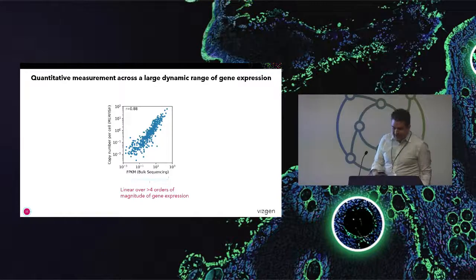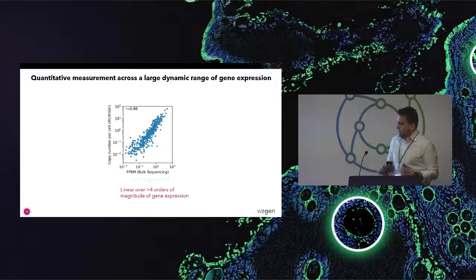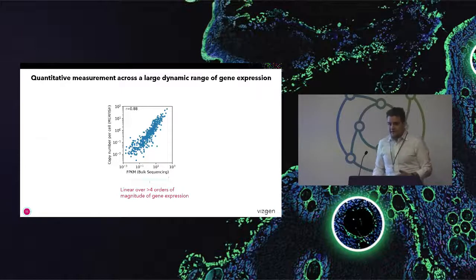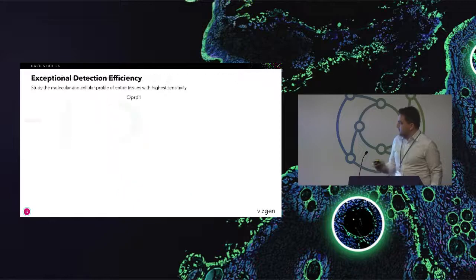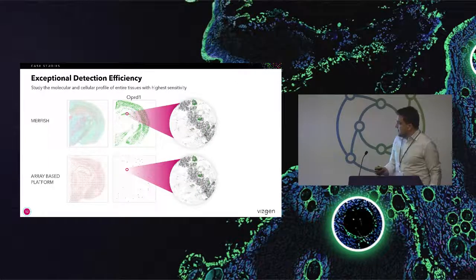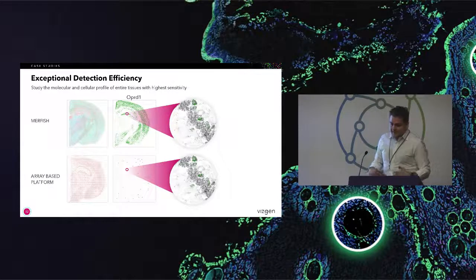But additionally, since transcriptomics is a relatively sparse signal in the first place, a lot of very functionally relevant genes are expressed at just a few tens of copies per cell. The ability to detect a large fraction of those tens of copies is really critical to understanding what's happening in that biological tissue. This comes in the data in terms of detection efficiency, or what fraction of expressed transcripts you are actually able to detect. So here, since it's a direct in situ measurement, we don't have to extract the RNA molecules and put them through molecular biology to amplify the signal. Rather, we just fix the tissue, hybridize to stain it, and then read out these binary barcodes.